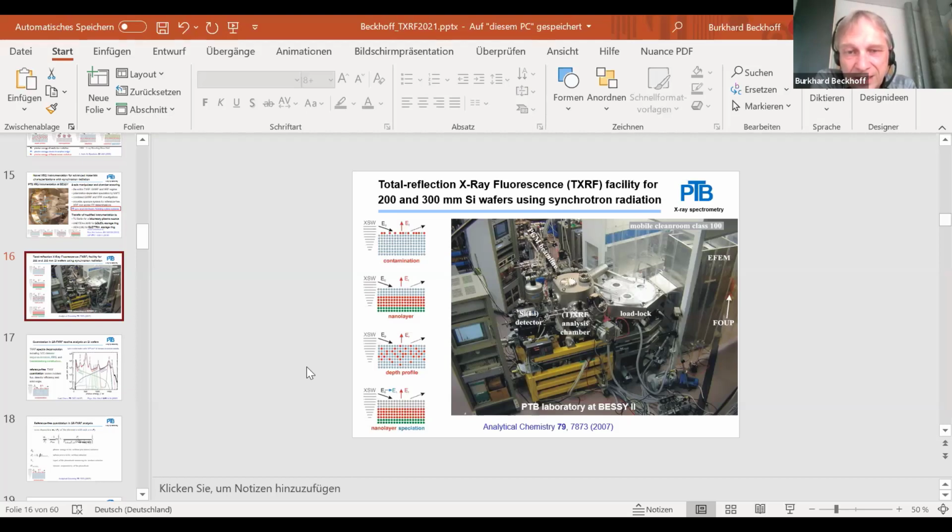The later SDD detectors achieved resolutions, peak-to-valley ratios, and low tailing contributions like the Si(Li) detectors after a second or third technology range. I would say since about 7-8 years they are equivalent, and you can operate an SDD detector as a windowless detector and just allow it to get pumped down overnight in order to remove all kinds of contamination or ice layer.